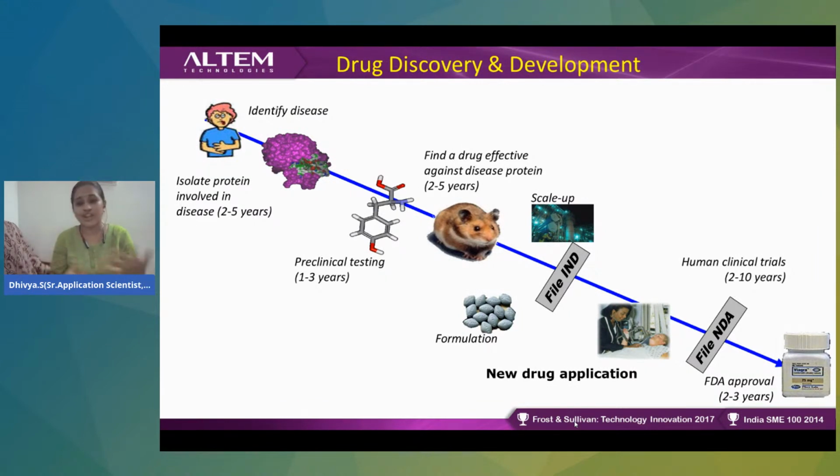Maybe it is because of genetic patterns or maybe environmental conditions. So many parameters are actually involved in this process. But in spite of all those things, we need to achieve the maximum efficiency of the drugs. How is it possible? There is a way that it can be done through 3D printing technology utilizing 3D models. Since we are a 3D model, if you try to do this analysis in a 3D model, that will be a great solution to accelerate the drug discovery process.